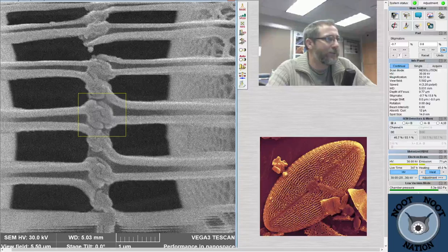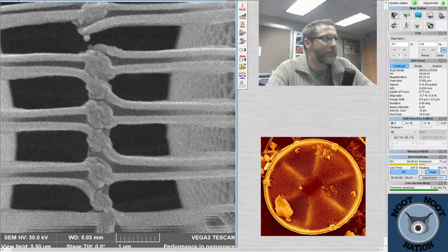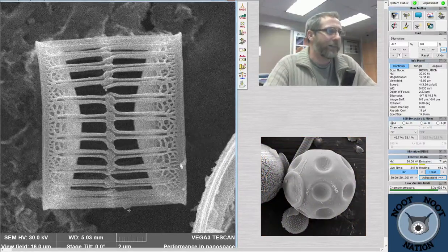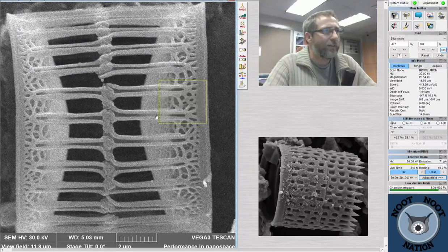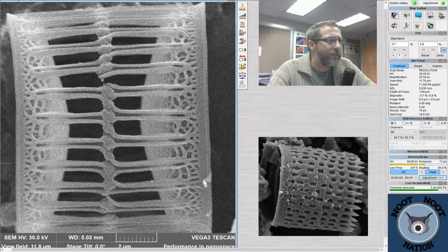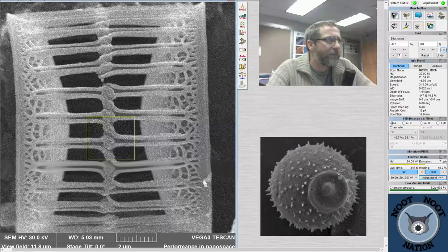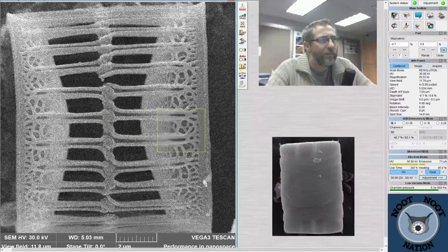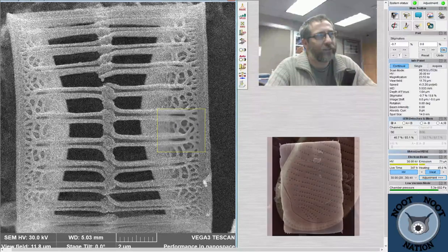What a pretty specimen this one is. And because I didn't screw up the stigmation in between, we should actually be able to see those little knuckled together spines on the skeletonema. So that other one that we saw was a cluster of skeletonema, but it had like a girdle band wrapped around it. This one does not have the girdle band. So we can actually see all the structure in here. Sorry, I'm just tweaking this a little bit so that the photo doesn't end up slightly blurred like the other one did.